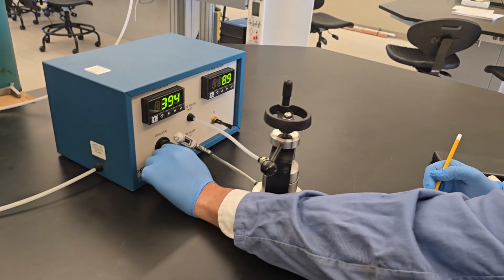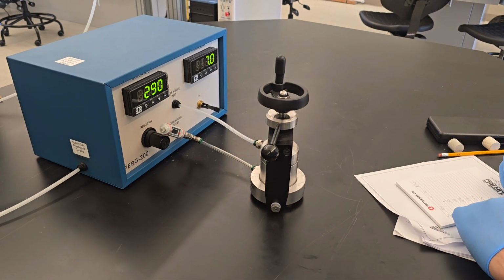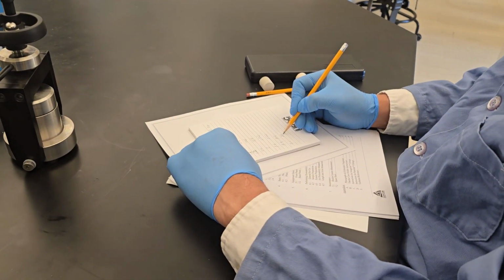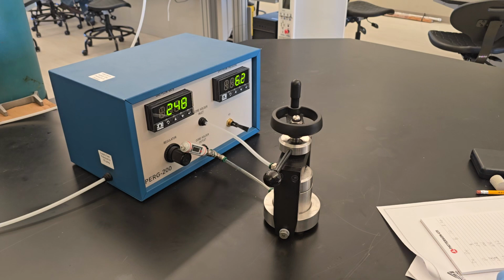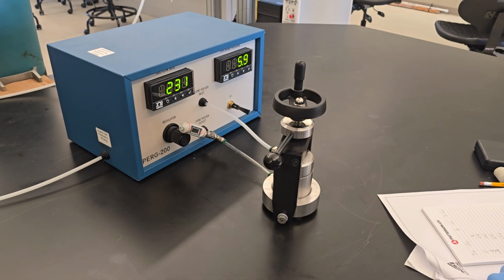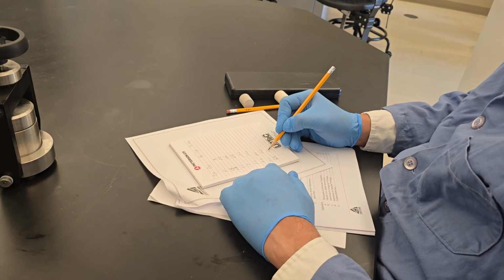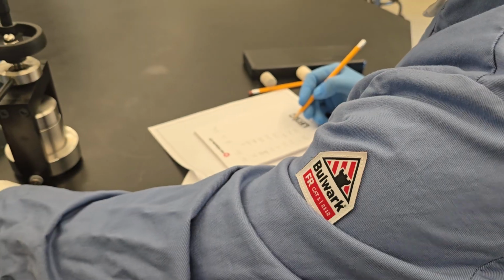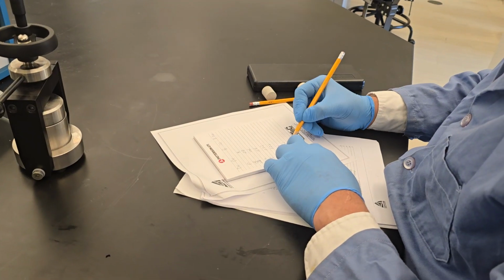So I'll go down and collect more data points. So 7.0, another 7.1, I got 291, 292. Then go down. Okay, 6, 5.9, 231, 230. All right, 230 it is. 230, 229. So I'll make it 229. 228.